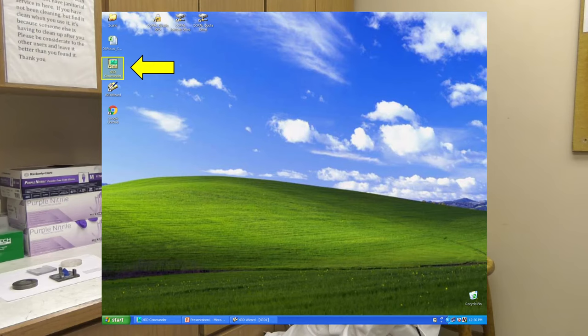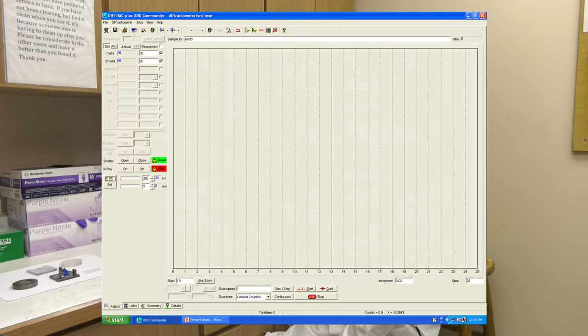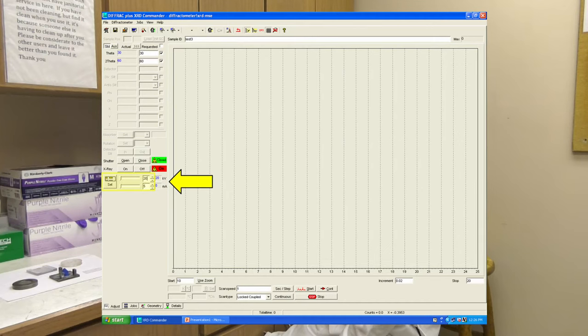Operation of the instrument is done through the XRD Commander application. Before starting a scan, the X-ray generator power must be slowly ramped up to its desired output. First, voltage is increased at 5 kilovolt increments by typing in the next value and clicking the Set button. The X-ray generator is allowed to rest for 10 seconds before the user increases to the next set point. This slow ramp in power will ensure increased longevity of the X-ray generator.